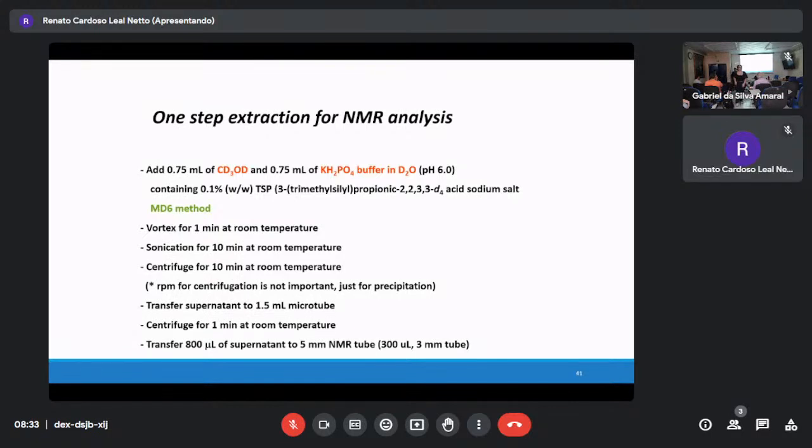Yeah, pH. NMR chemical shift. If you do one-time NMR measurement, actually you don't need a buffer. But if you have 100 or 1,000 samples, for example, one signal comes out at 1 ppm in the NMR spectrum.